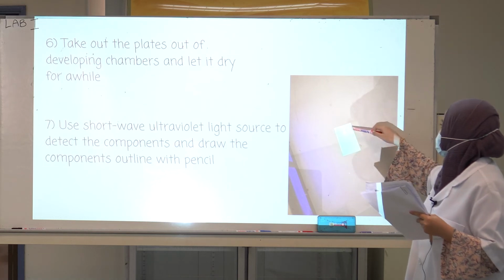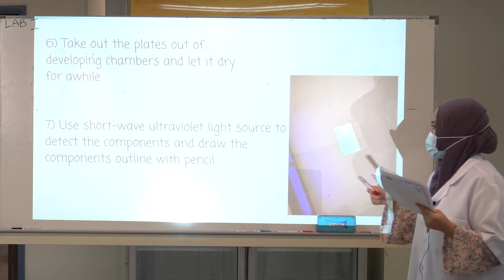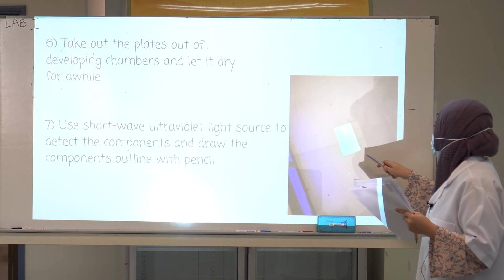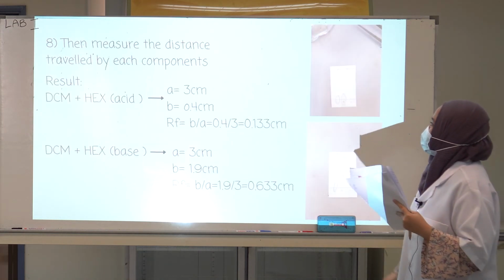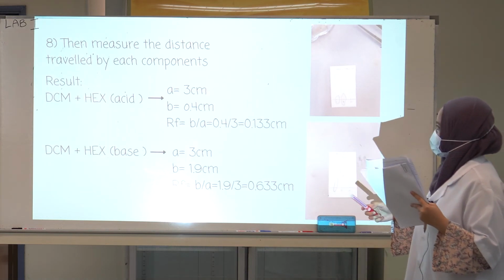During this, we have to be careful because we are handling shortwave ultraviolet light, so it's quite dangerous. So we have to be careful while doing this. Okay, next. Then we measure the distance traveled by each component.